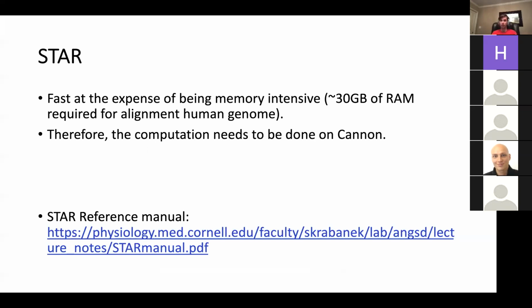This is why we're making everybody do the computation on Cannon, because we don't think that most people have that kind of resource on a personal laptop, for example. If you have the slides or the file on your computer, it might be nice to browse through the reference manual for STAR. It will show you how to do a lot more advanced things that won't be covered here.